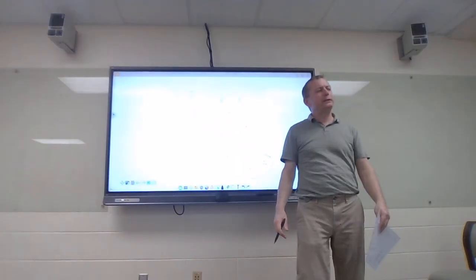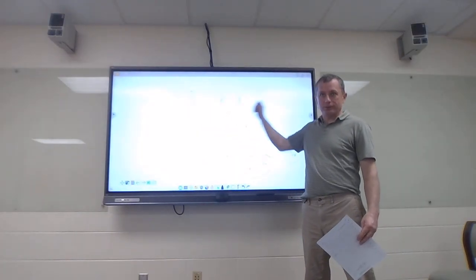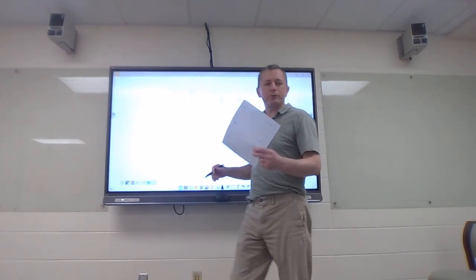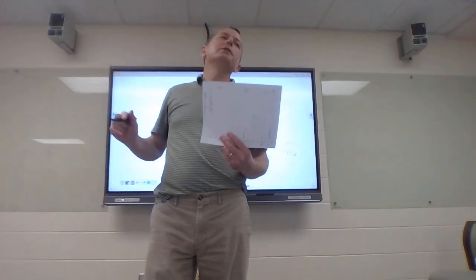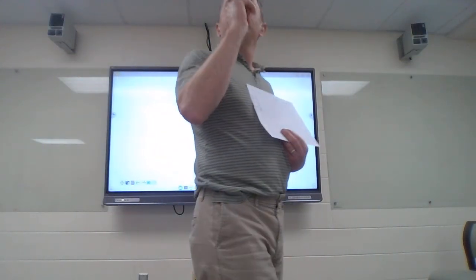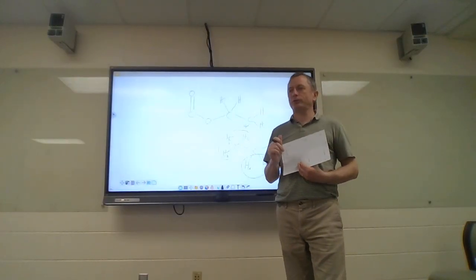What's that third peak? Oh, and by the way, if you look at the integration of 2, integration of 3, we see that pattern. The third peak is showing up closer to 2, and it's got an integration of 3. There are 2 things that I look for when I see hydrogens around 2.